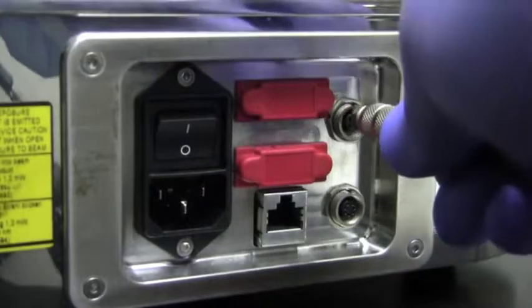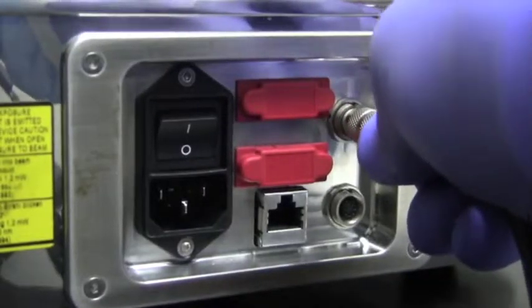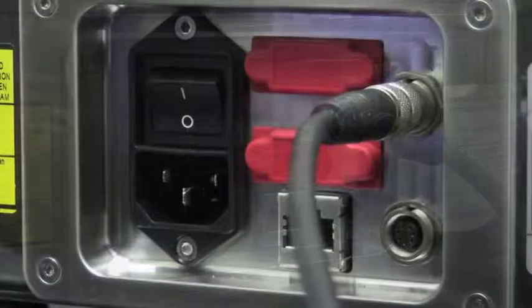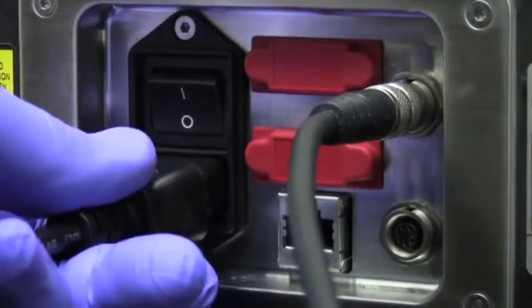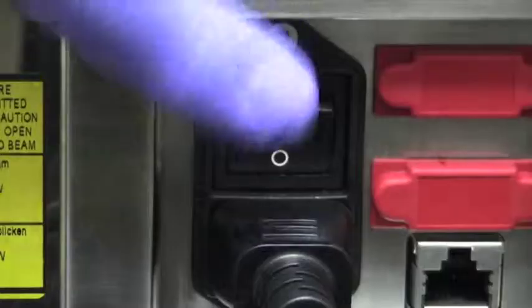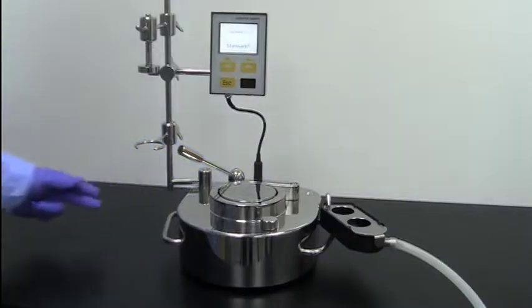On the rear panel, connect the foot switch to its socket. Attach the plug to the AC power socket. Finally, press the ON-OFF switch to power up the Sterisart.